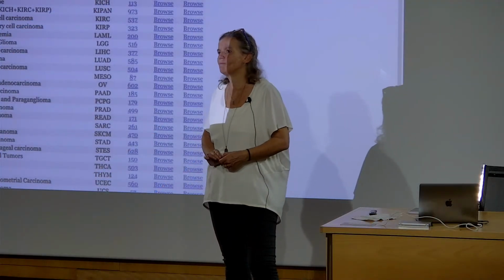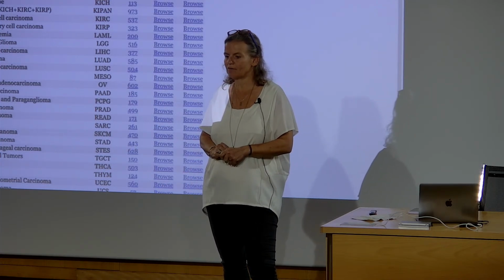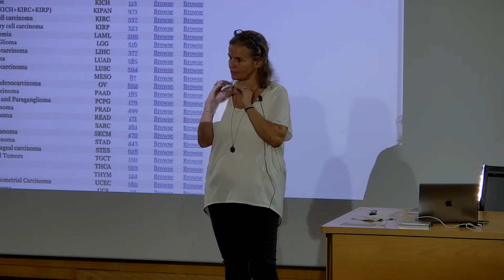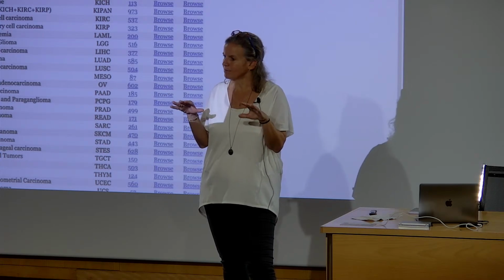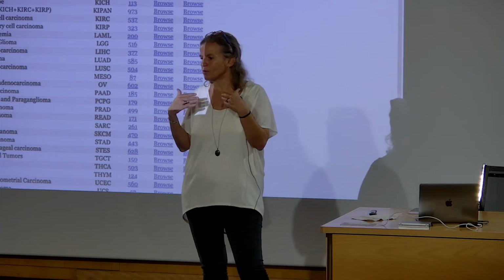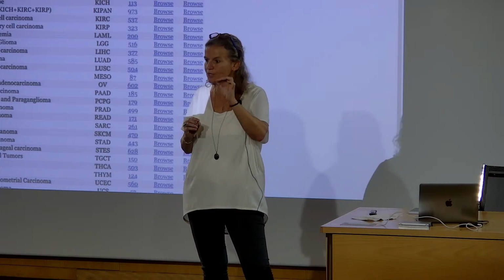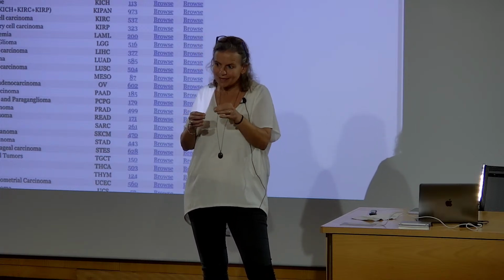For instance, we have some investigators that are treating the cells, and they have found that some of the cells remain senescent. Senescent cells are those that remain not dead, but calm, and all of a sudden they develop a new cancer. So we use single cell to identify those senescent cells because those have a specific expression for specific genes. They have genes that have high expression. So we need to detect those at the single cell level.